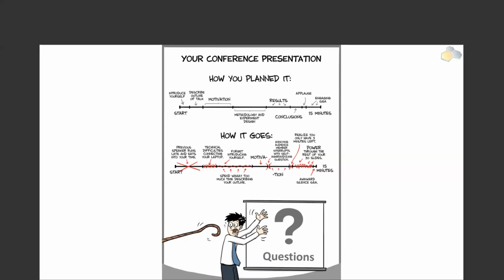So I'm going to add another comment here. So this is Raja, and what we do believe in is that figuring out if the tool is working the way it should, and are we finding what we intended to find in the first place, is going to be an ongoing effort. But what can be done right now is recording all of that information in such a way that people can reproduce it, replicate it, and so on.